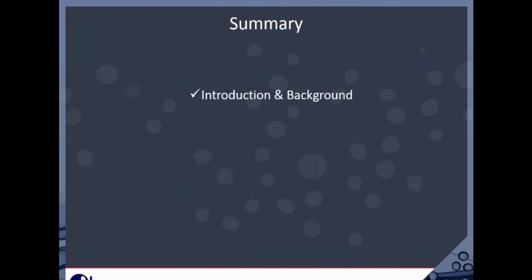All right, so we've covered a lot today, some of the background of what kind of application this is and who would be using it. And when it's a lot of unknown samples that you're culturing in suspension, it's a very helpful, quick way to assess the viability and concentration of cells.